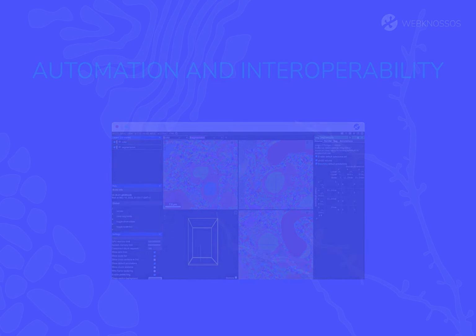To begin this tutorial, I will show you how to export your data as TIFF images. Start by creating a bounding box with the Bounding Box tool. Adjust it so that it covers the desired area.